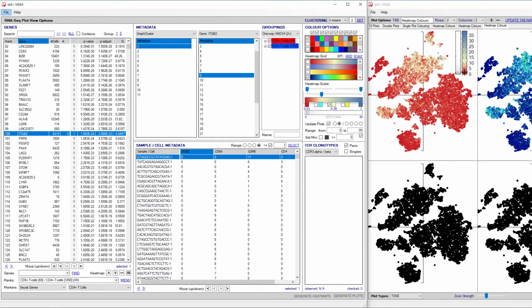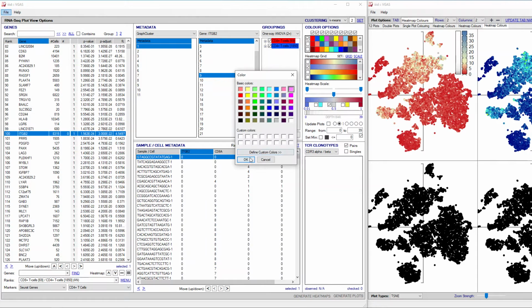To change the color of the scale to one of the preset heatmap colorings in the grid, select the desired one and then click Set Scale. Heatmap scale colors can also be selected manually by clicking on any of the 5 colored boxes and selecting a color.